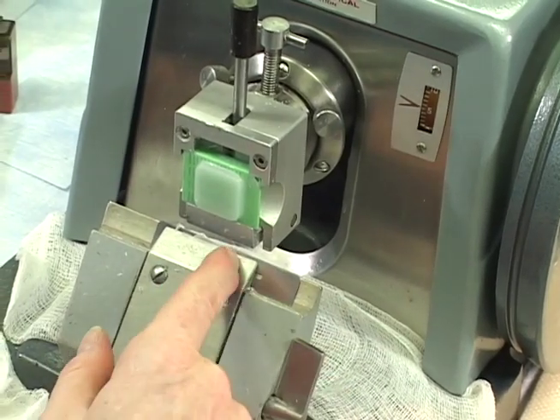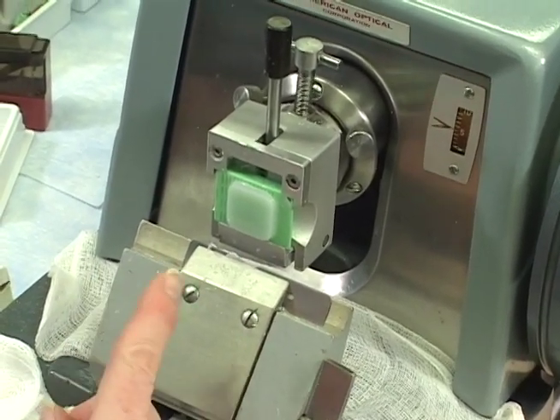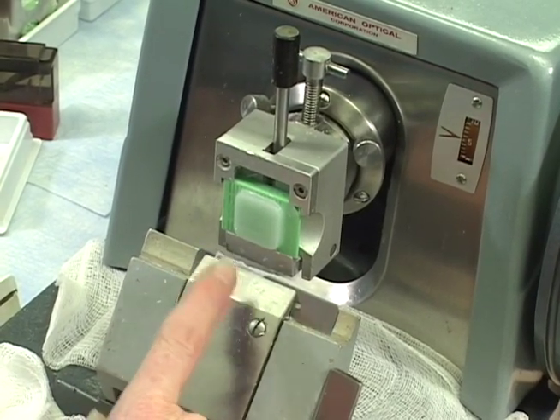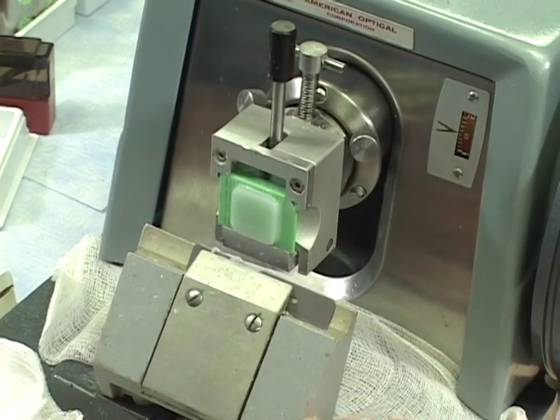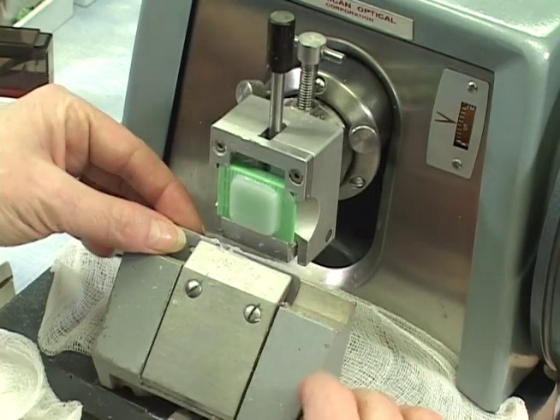Now let's say this part of the knife wasn't giving us lines or any problems, we could still use it again. If it's giving us problems and has little knife lines or stops ribboning, it's getting dull. What you do is release the clamp and slide the knife down a little past there and do it again.